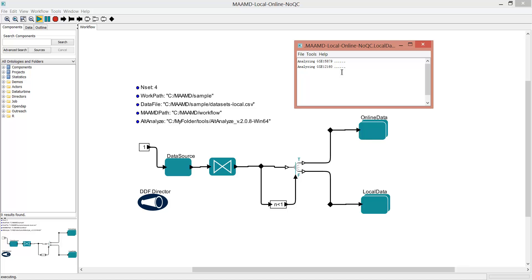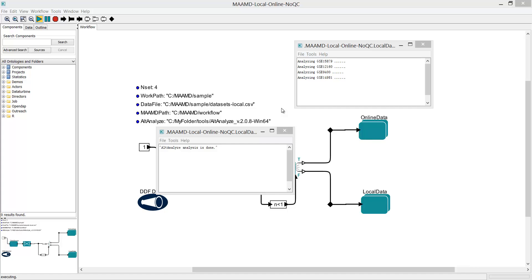MAMD will analyze these datasets one by one. And once it's finished analyzing all datasets, a dialog will show that you finished the intra-dataset analysis.